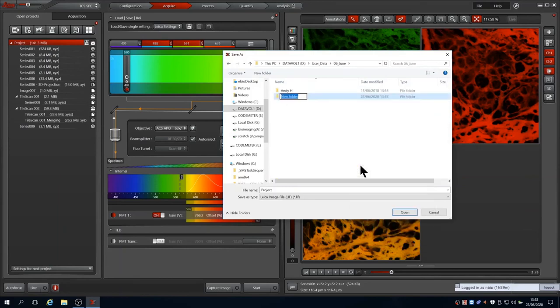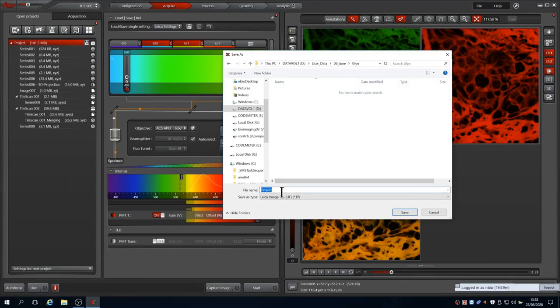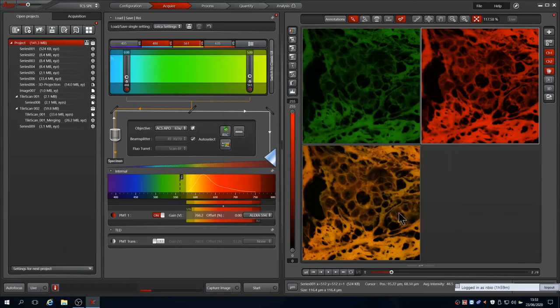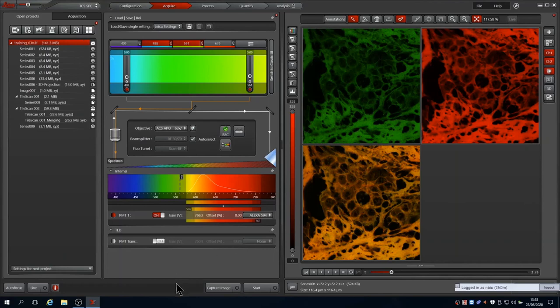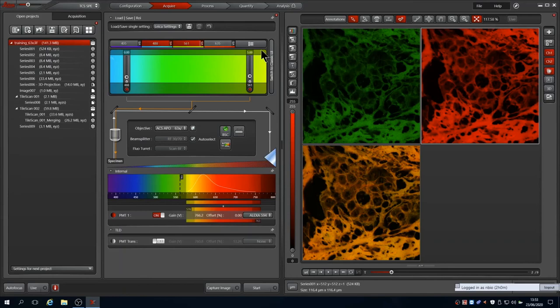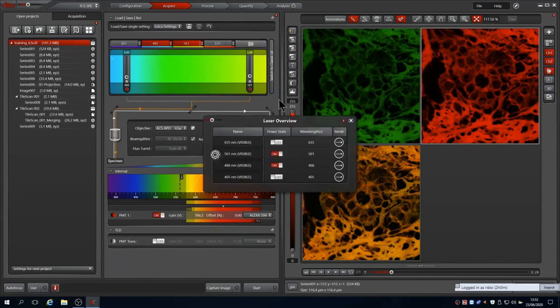This system has a local D drive with month folders on it. Use one of these and create a folder with your name and save the files with suitable naming. You should also have access to your group's network storage, so you can save to these if preferred, or you can move your data afterwards.